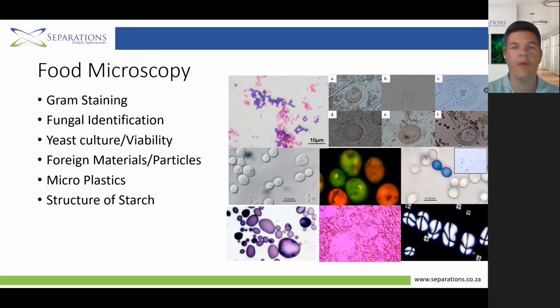As I mentioned before, microplastics in bottled water, foreign materials, particles such as plastics, metals, and paper found along the food manufacturing process, and then also, as I mentioned, the structure of starch.